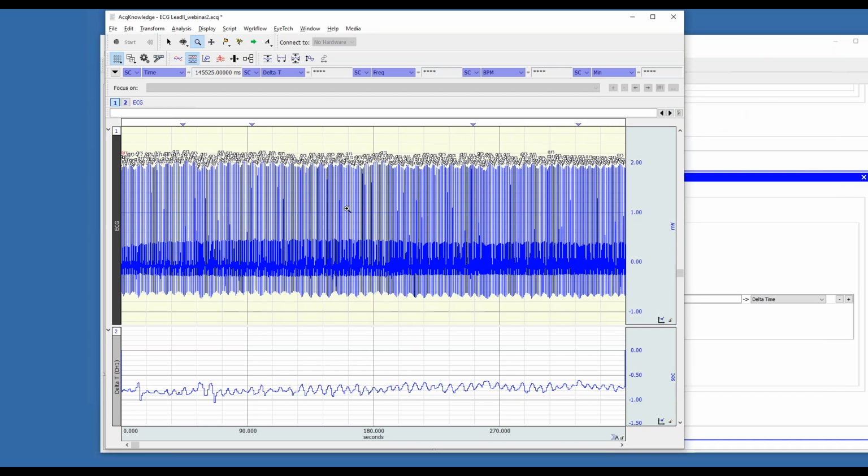And if you're unfamiliar with the find cycle peak detector, if you go onto our YouTube channel, there's 5 or 6 screencasts that work all the way through all the features of the find cycle peak detector, from just basic introduction to the user interface all the way through to plotting 3D signals.